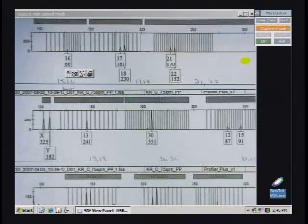One thing that I noticed right off the bat is that if you cut 75 sperm cells, you should be getting much higher RFUs than she did. Now, one nice thing is that we have a lot of the alleles, but not all of the alleles. We detected some, but we don't have that 15. It's not too bad. How much higher are you expecting? At 75 sperm cells, I would expect it to be close to saturated, really close.